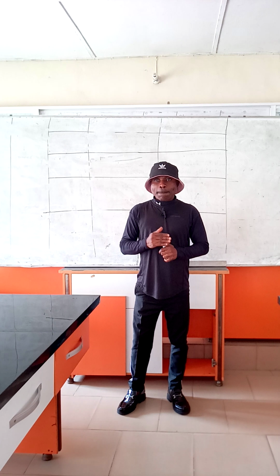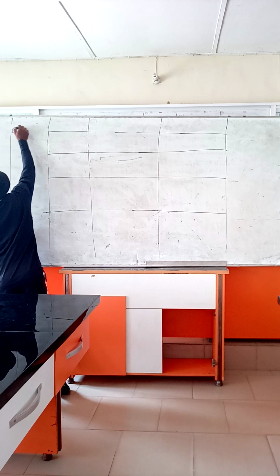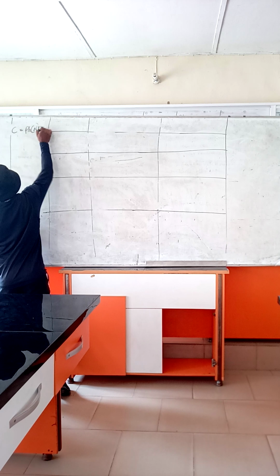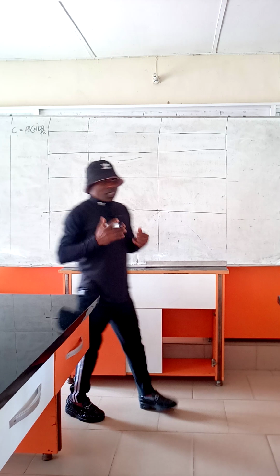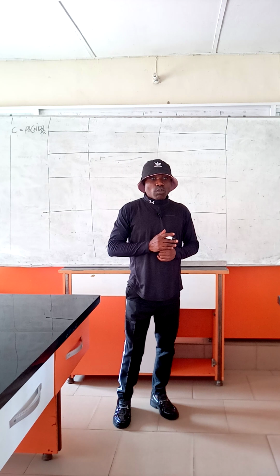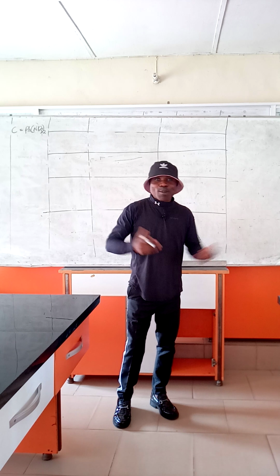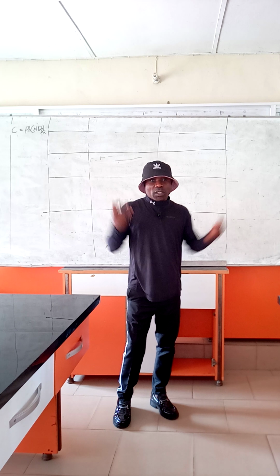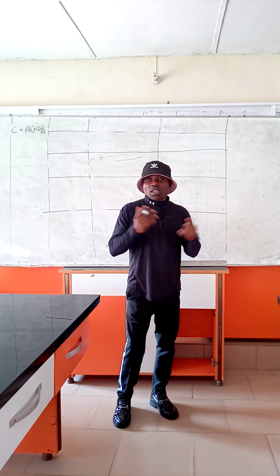But in this video, let's start by analyzing salt C. Salt C is Pb(NO3)2. Now, this is a predetermined test, which means these are tests that have been done and their results are determined even before the world of chemistry began. So it is possible that one can gain mastery on the mechanisms of identifying cations and anions using different reagents.